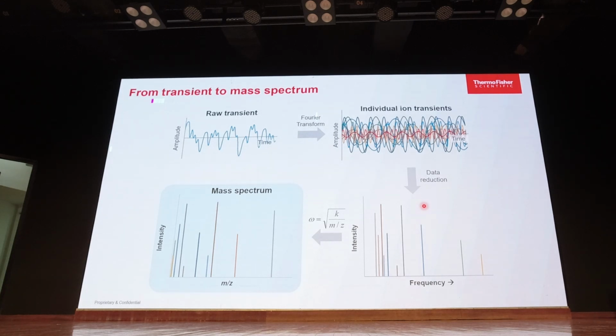The advantage of the Orbitrap is that we capture these ions, so we can do a lot of oscillations and measure very precisely. That's the reason it gives you very high resolution. In other mass spectrometers, the ions just fly, and you don't have time to study those ions. But this is a trap, and we have all the time to study those ions and get higher resolution. So even close isobaric species can be resolved because we can spend more time to get this done.